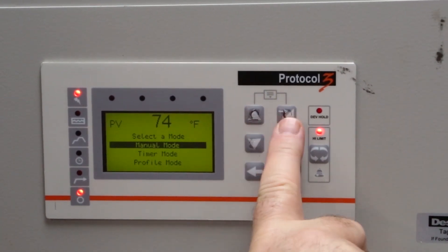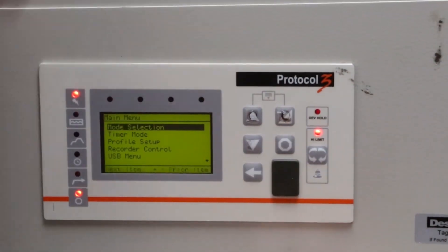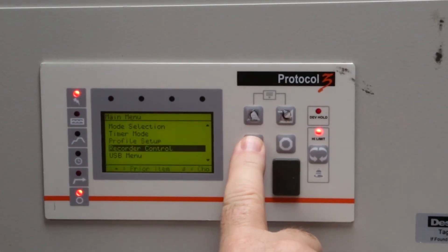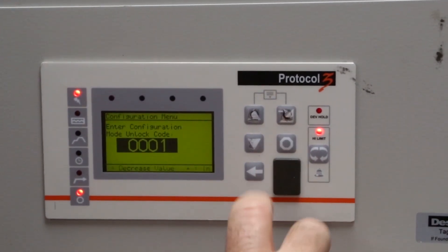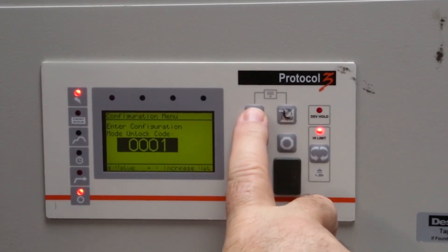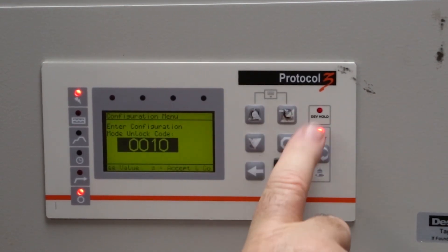Next, press the up arrow and the enter key at the same time to access the main menu. Press the down arrow to highlight the configuration menu, then press enter. Use the up arrow key to set the mode unlock code, which is 10. Then press enter.